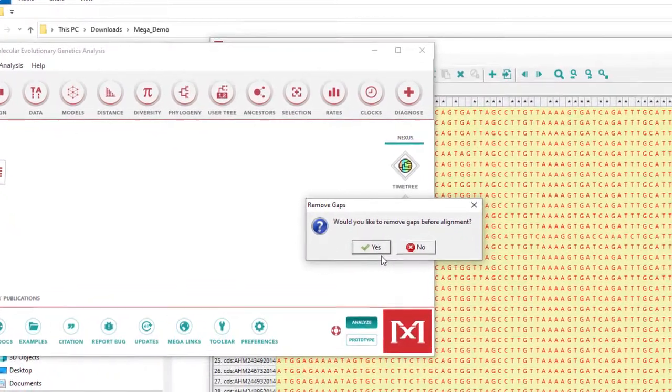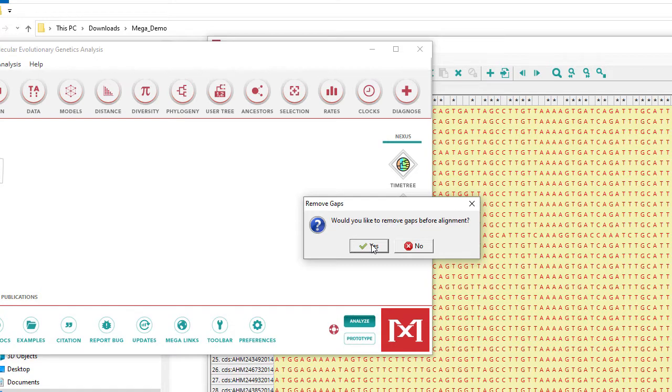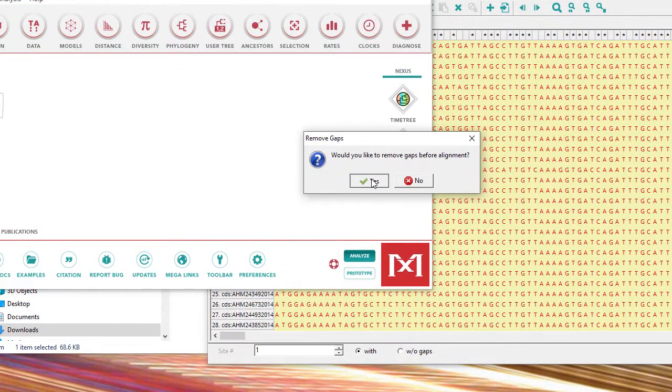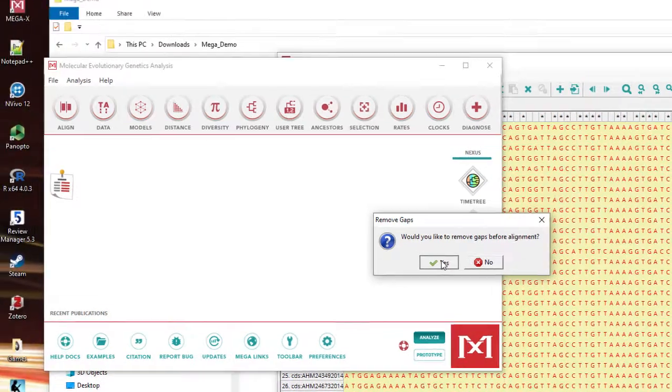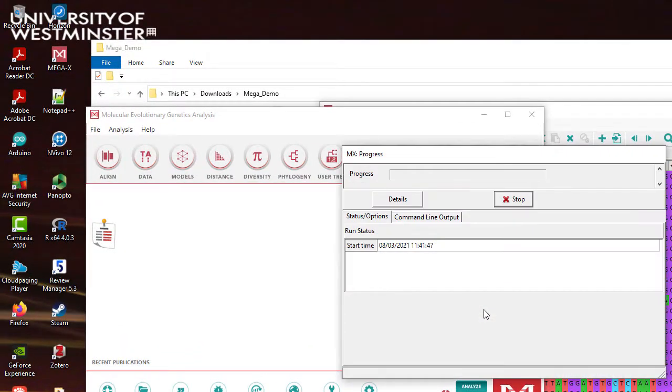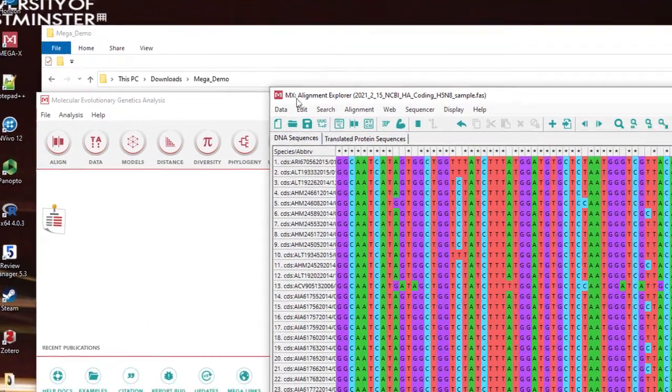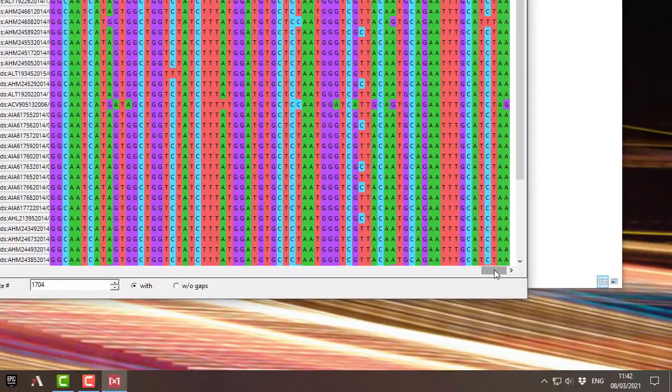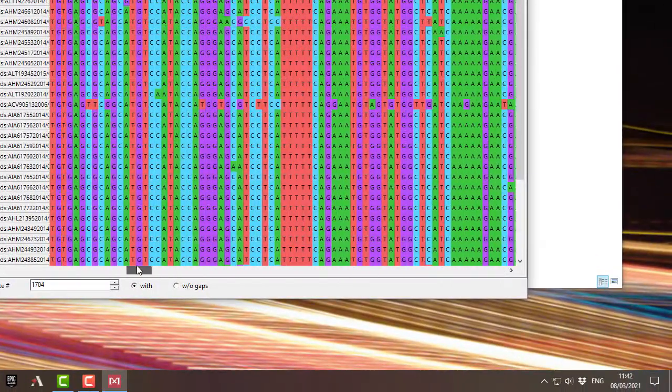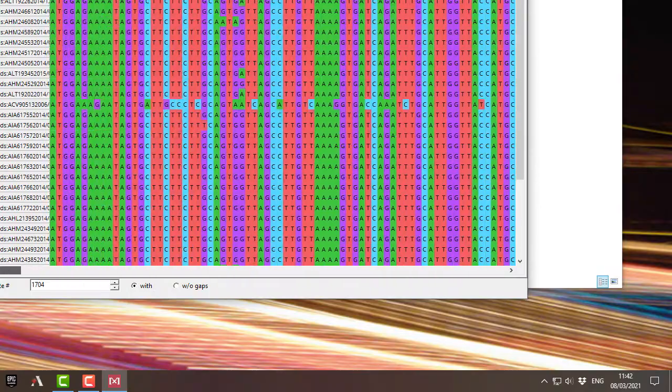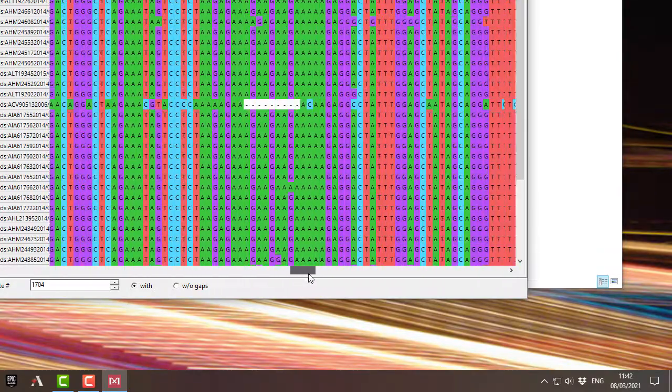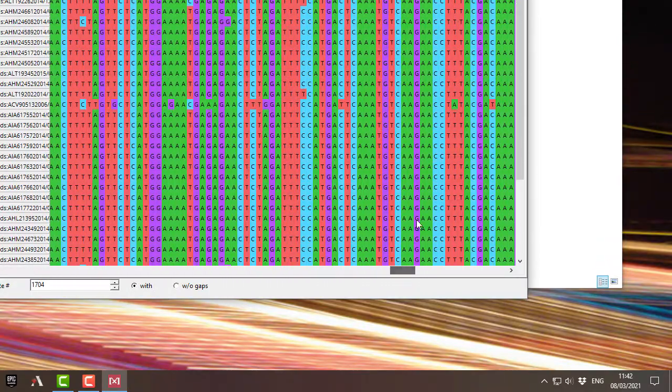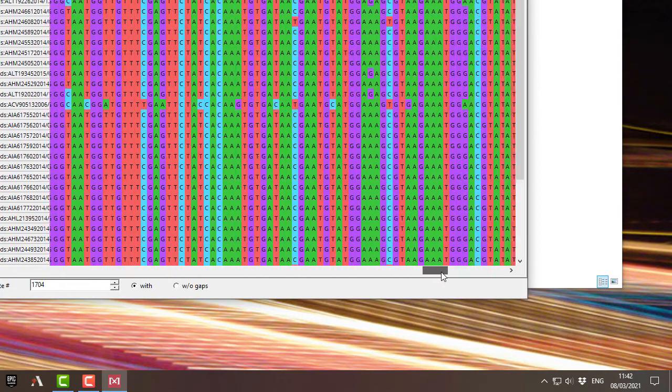OK, it will remove any gaps if this is a previously aligned set of sequences from a different program. Now there aren't any gaps here at the minute but that's fine. It can remove them anyway. It's gone, done the alignment and finished. Now before one of the sequences near the top got out of alignment as you went through the sequence, you saw a sort of jagged thing.